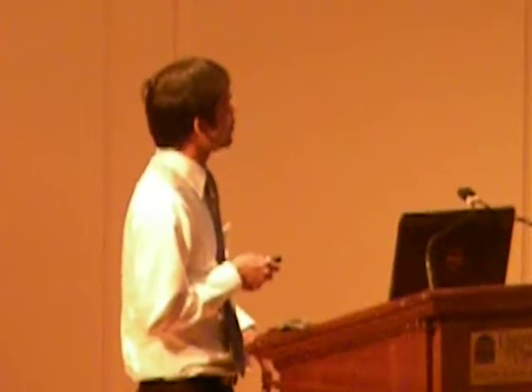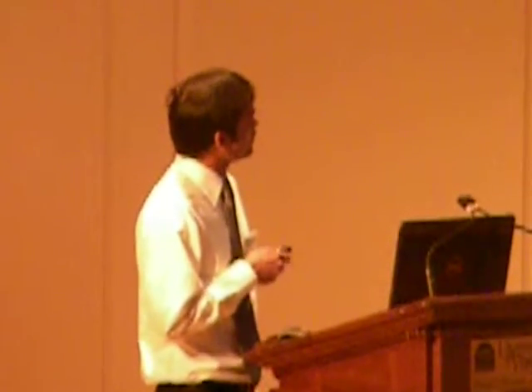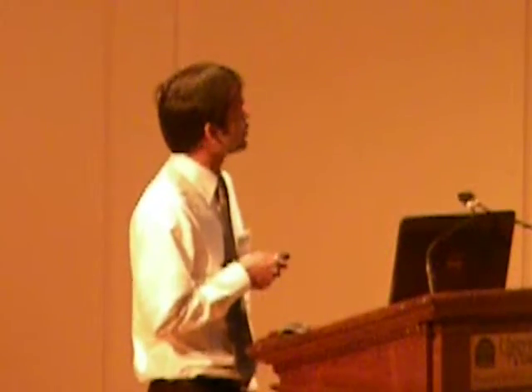I used the DAMMIF shape reconstruction. For all 5 samples, I ran 10 independent jobs from each of the 5 samples under investigation, so a total of 50 jobs, and did the shape reconstruction using the software. As we saw, in the pair distribution function there are 2 peaks. This shape reconstruction is consistent with our pair distribution function, so it has 2 lobes connected by a small connector region.